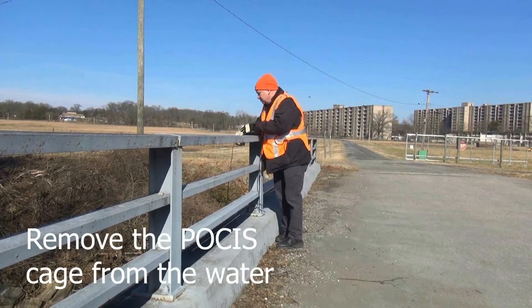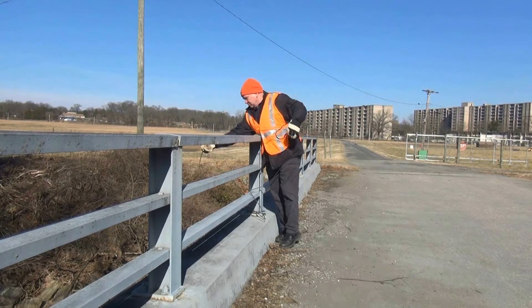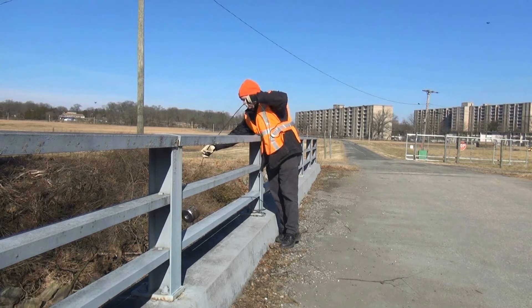First, remove the POSIS cage from the water. Be aware of your surroundings and take appropriate safety measures, whether in a forest or on the road.